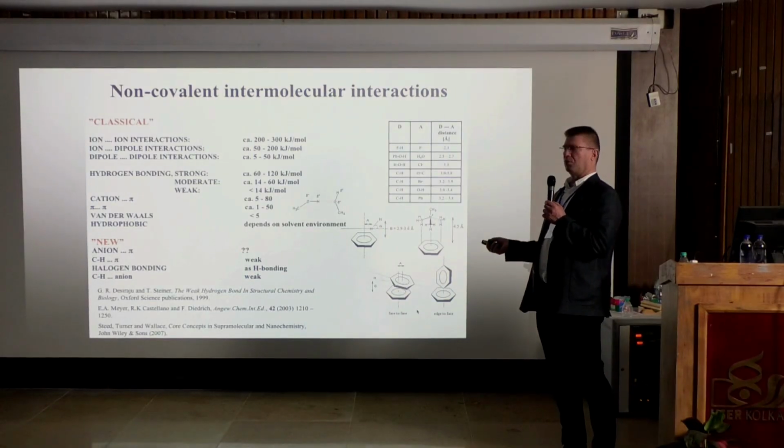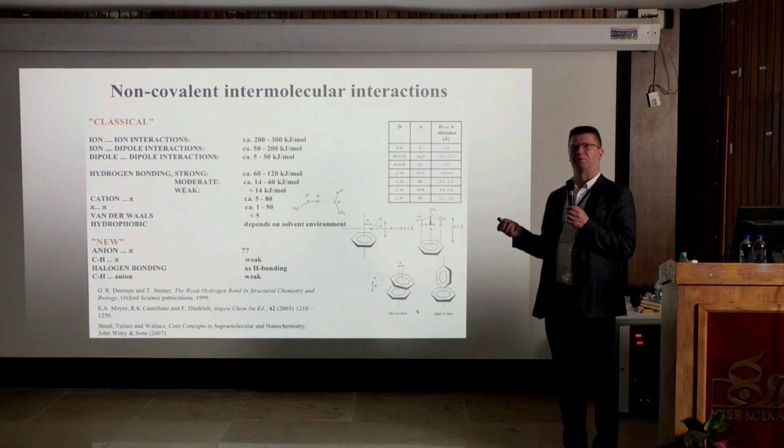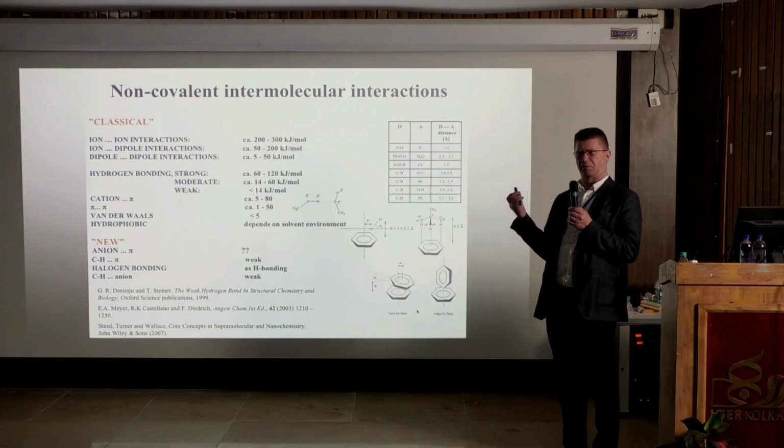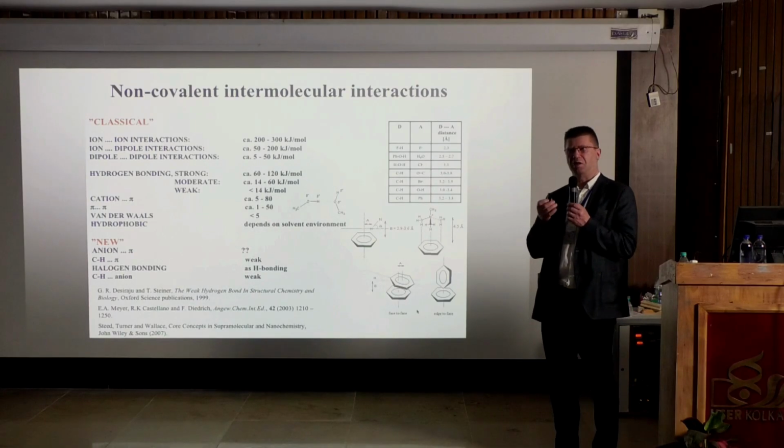And this is the actual idea, I think, of what we can get out from there. Yesterday I showed you only halogen bonding for these, but we have done all of these. You can extract this information, like we did as an example. We were looking for the hydrogen bond. You can study everything in there.